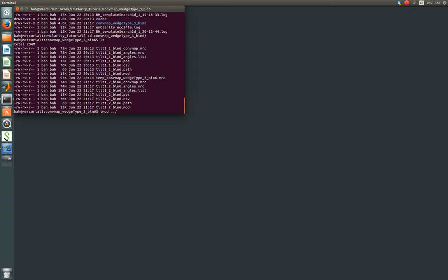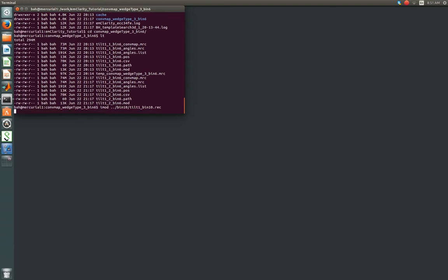Firstly, and you don't always need to do this, particularly when you become more familiar with your sample, we're going to open up the bin10 tomogram back from our bin10 directory. This is tilt1 bin10.rec.